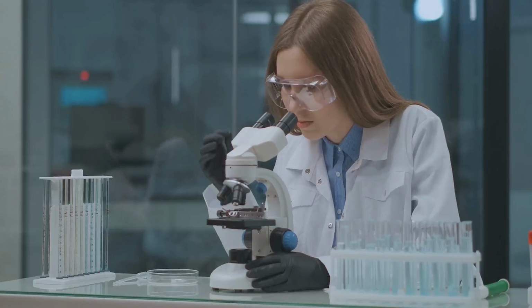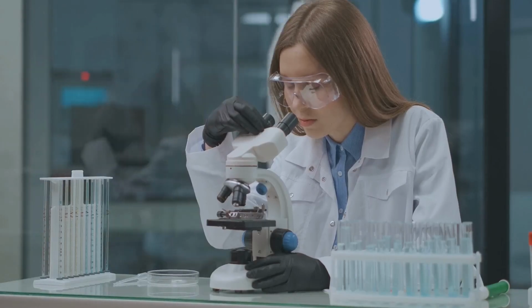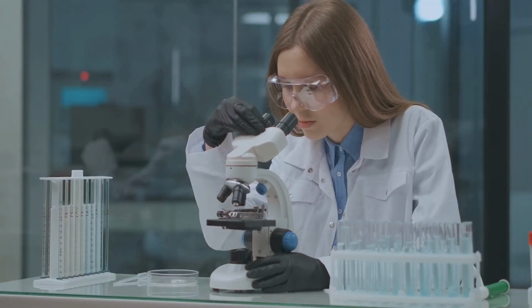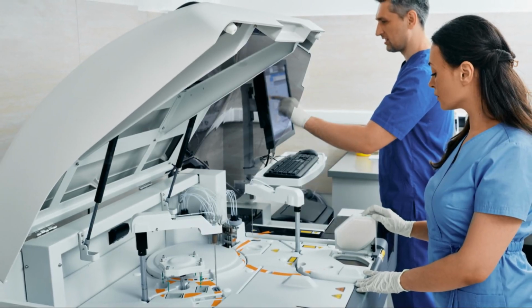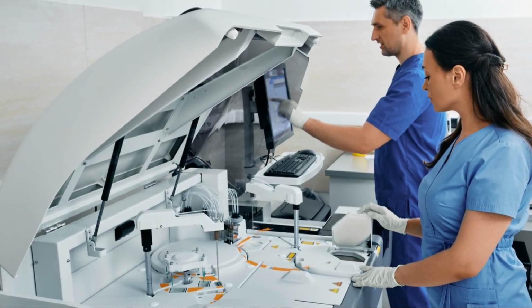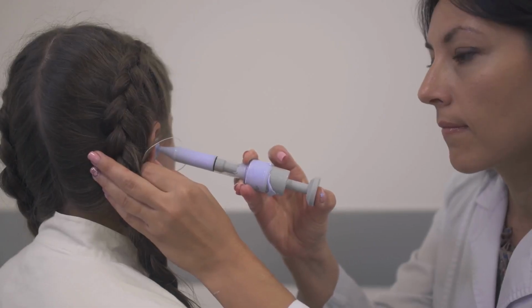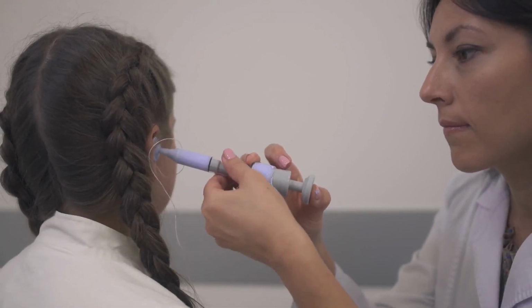The clinical relevance of microscopy is often less obvious for students who have set their goal to become a healthcare professional. Learning the proper care and use of the microscope is a starting point for helping you learn to use other more sensitive diagnostic instruments such as EKG monitors, otoscopes, dental intraoral cameras, and many more.